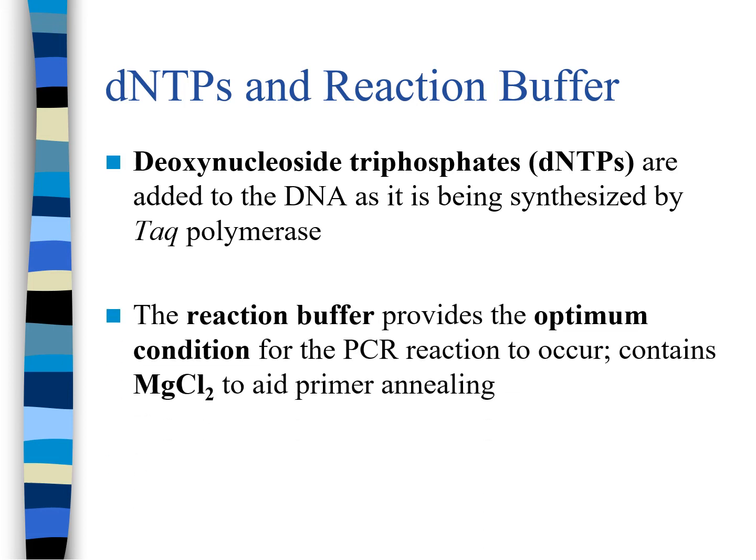Now, the reaction buffer provides optimum conditions for the enzyme, the Taq polymerase, such as the salt concentration of magnesium chloride, to aid in the attaching of the primer to the DNA.